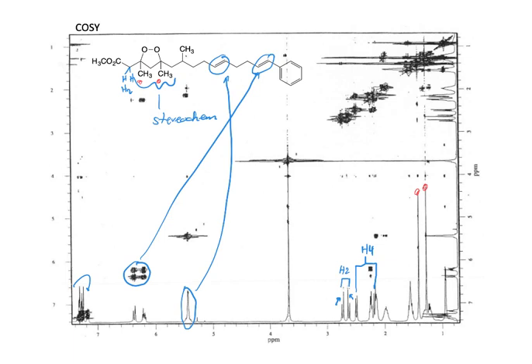Just trying to think of why they're that far downfield. Well, what are they at? They're like at 1.3 or 1.4 or something like that. I was looking at the vertical one? No, the ones at 7. I thought you had just added that blue. And I was like, there's no way. Don't question me. Yeah, no, those two singlets that are upfield. That makes sense, yeah. Okay.